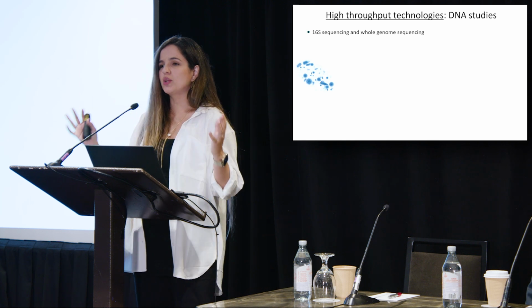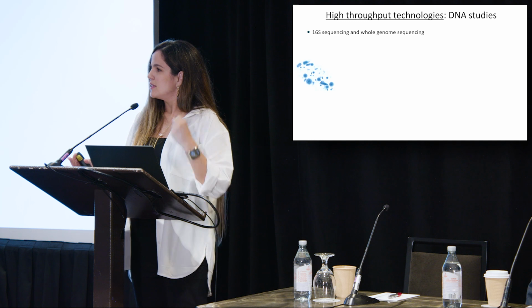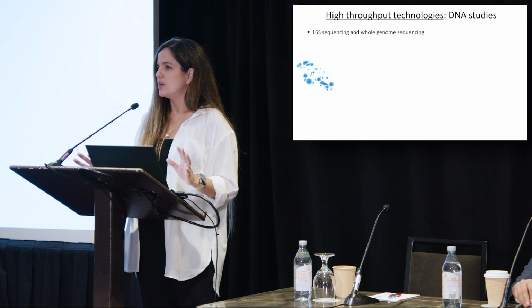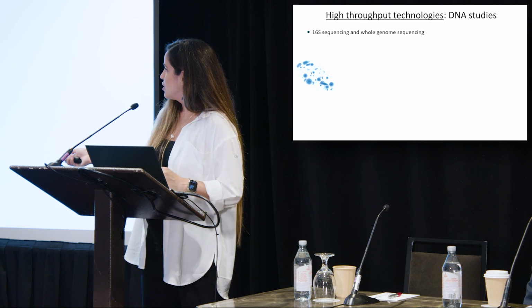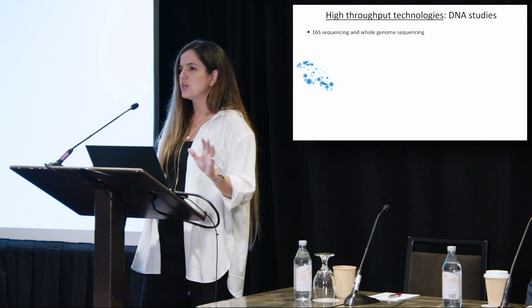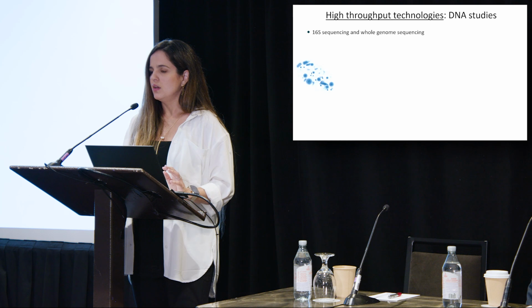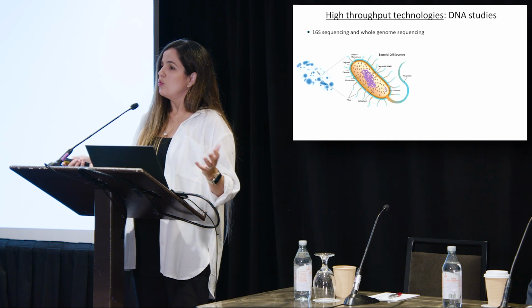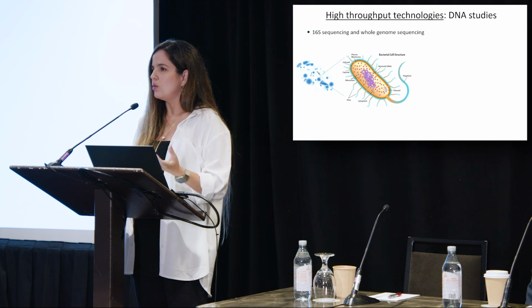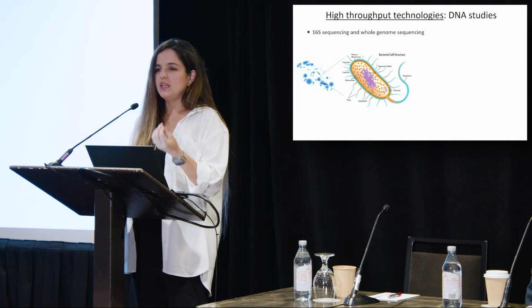Right, so from a broader, more research perspective, what we do is collect the samples from the small bowel, from stool, from any other site that you want to study the microbiome. We have a mix of microbial cells: bacteria, fungi, potentially parasites, lots of viruses all together. What we do next is extract their DNA, because the DNA is the code that every single microorganism has, and that code is unique to them.